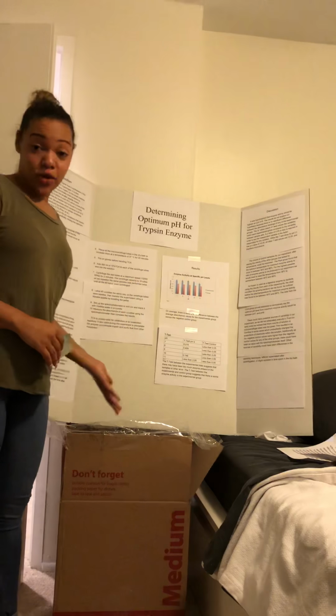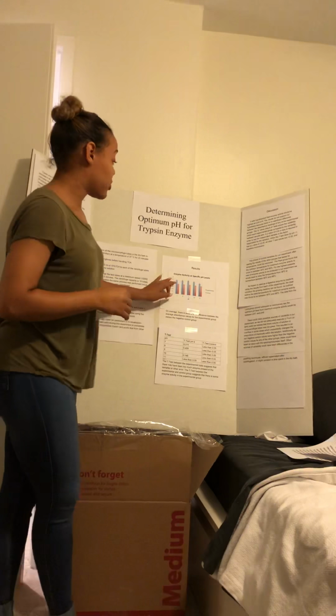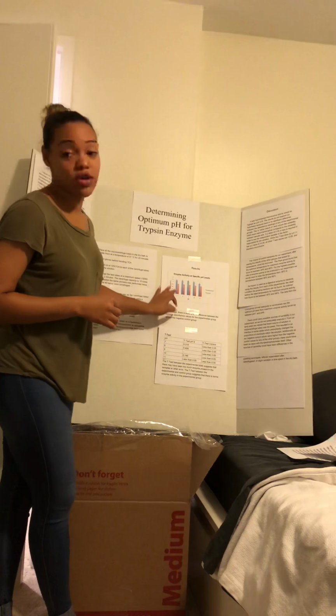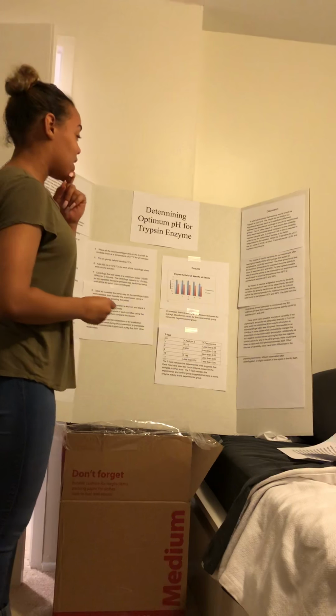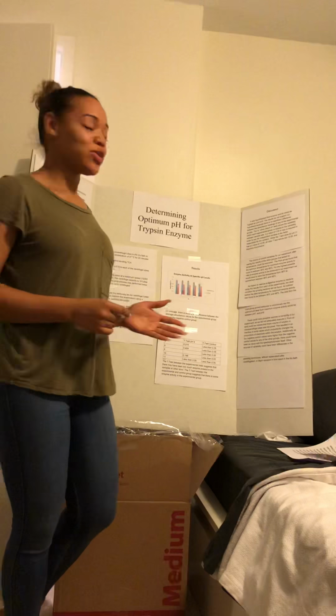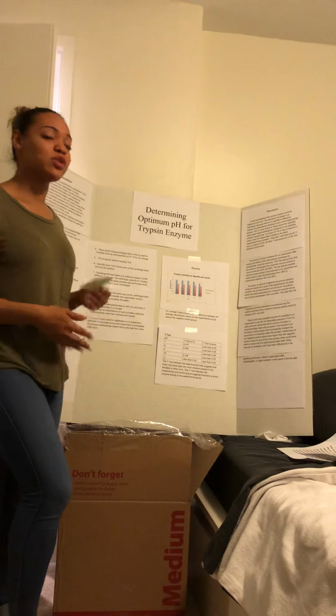As you can see in our results, we had some funky things going on. Here, our experimental group is in the blue, and our control group is in the red. There's not much of a difference between the absorbances in the experimental group versus the control group. There's actually about a 21% difference between those values. It raised some red flags for us in the beginning. You can see the negative controls actually have a high absorbance rate compared to the experimental group.